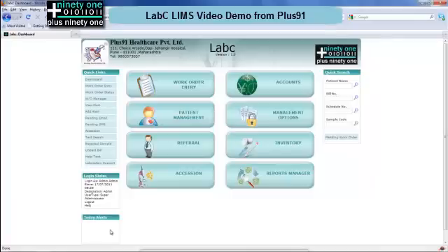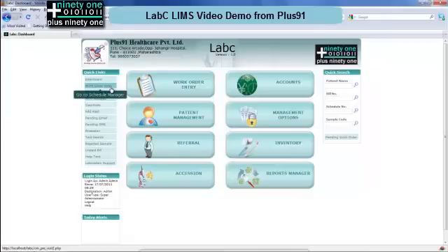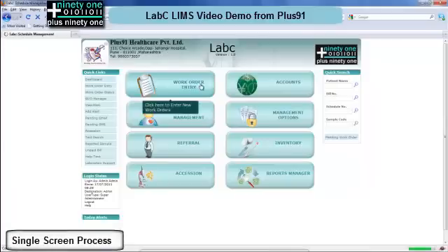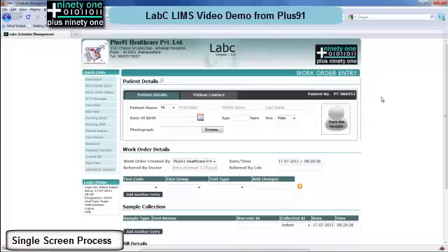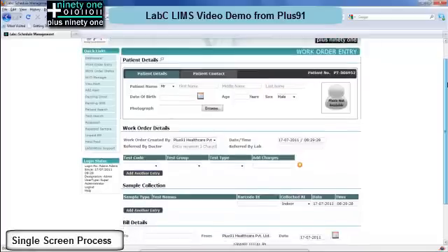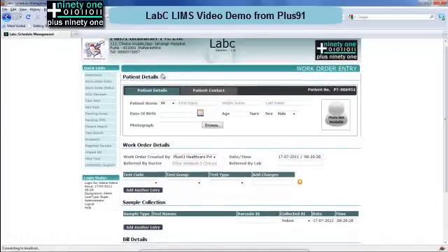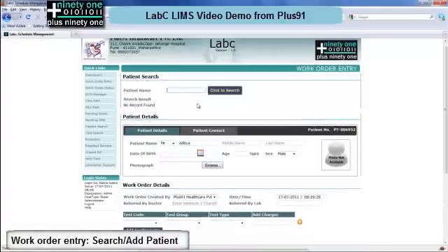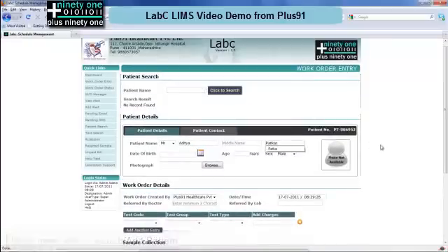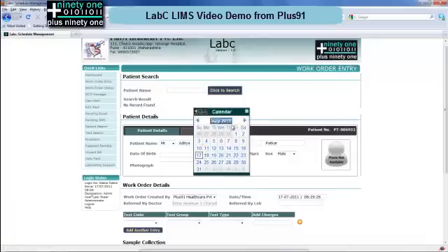LabC comes with two processes. One is a single screen entry for work order entry which includes the sample collection. The second work order process is entering just the work order, the tests as well as the bill, and having a separate sample entry screen. The first process is usually useful for collection centres where the collection centre enters the details of the entire work order including the sample collection on a single screen. The second process is useful where each department is segregated and the sample collection happens in a different room with a different computer system.